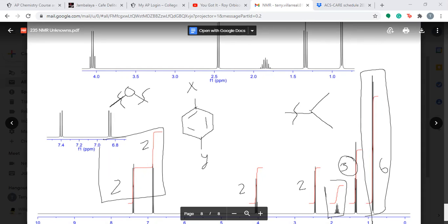That's the... CH3, right? Yeah. What is this peak going to be with integration of 2? CH2. It's going to probably be a CH2, right? And then what is this peak going to be here? CH2. Yep, it is going to be a CH2. So now all you have to do is just put these together.